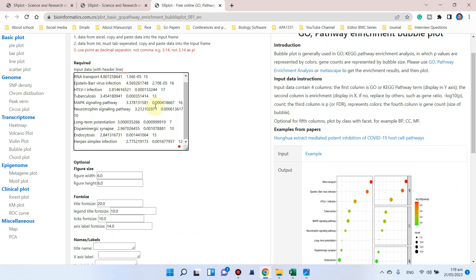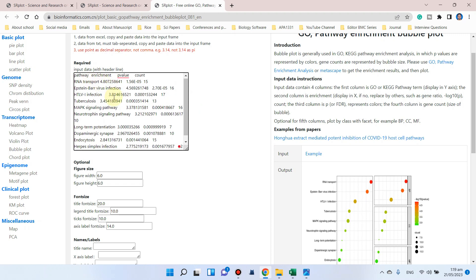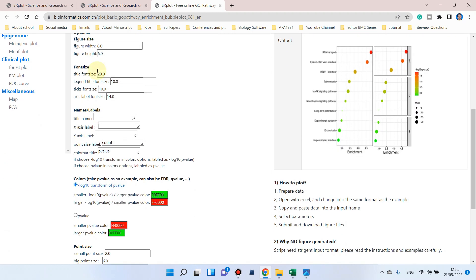Now you can see we can adjust the figure width and height if you want to increase or decrease. Similarly, you can also change the font size and name the label on the x-axis.